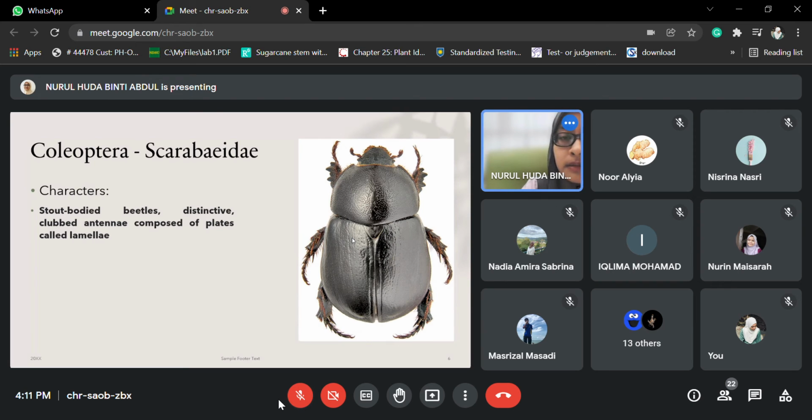Any other thing? It has a scutellum. Yes, of course.